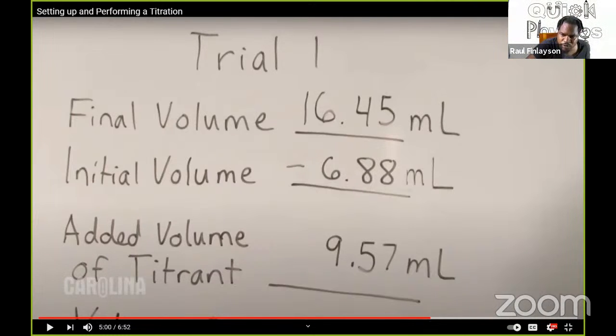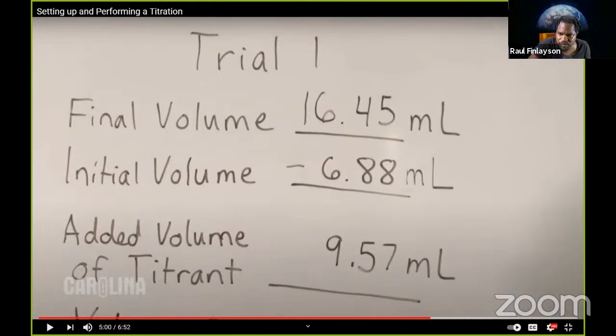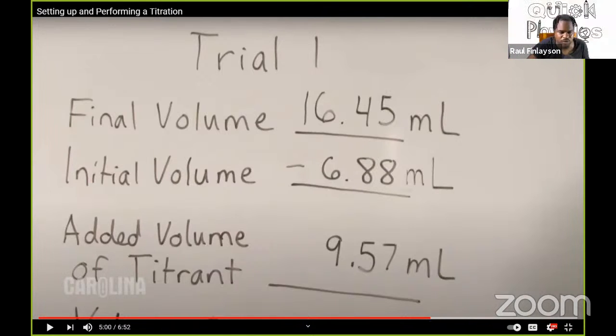We normally do 3 titrations though, 2 to 3, because accuracy is important for this. You run the titration at least 3 times, even in some cases 4, so you can get an accurate reading. When you get 2 readings from 2 different trials that are close to each other, those are the ones you're going to use for your measurements.